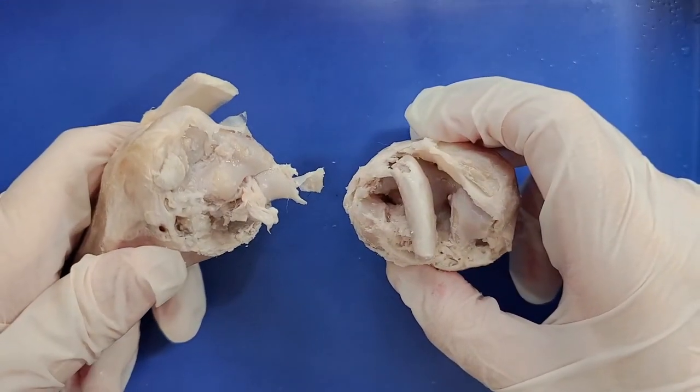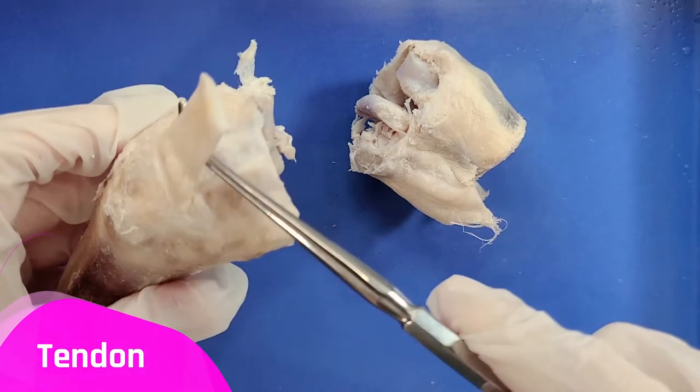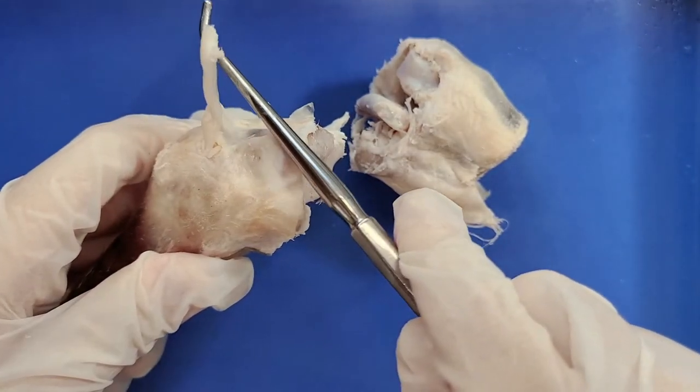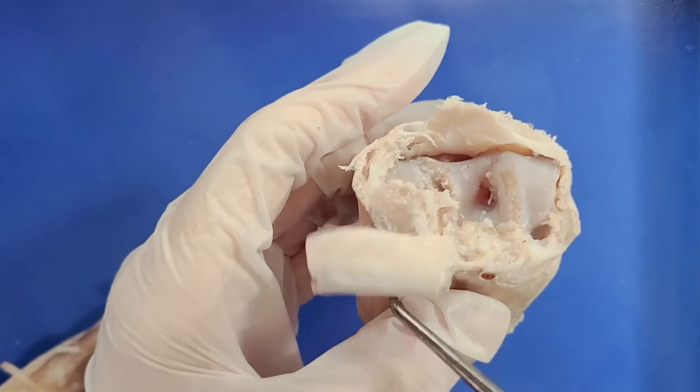Here are the two parts of the knee joint, and you can see a tendon right here that was cut. And on this side you can see a ligament.